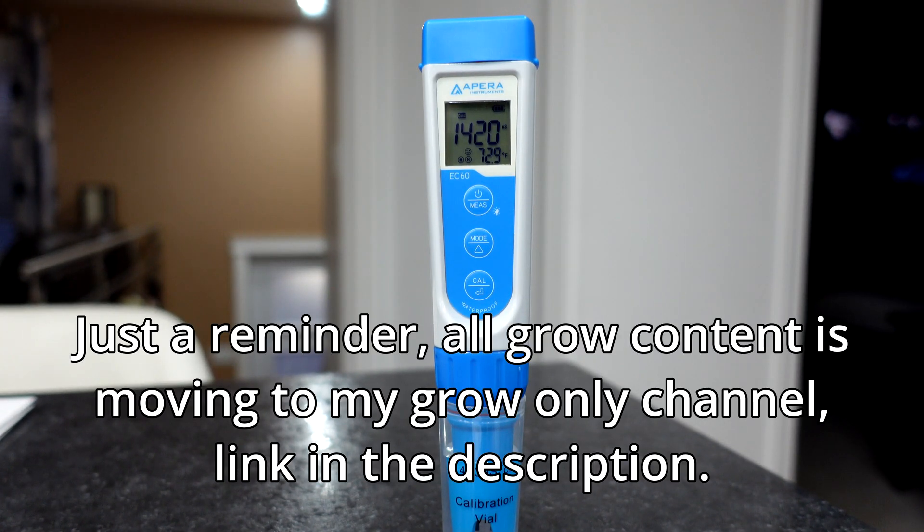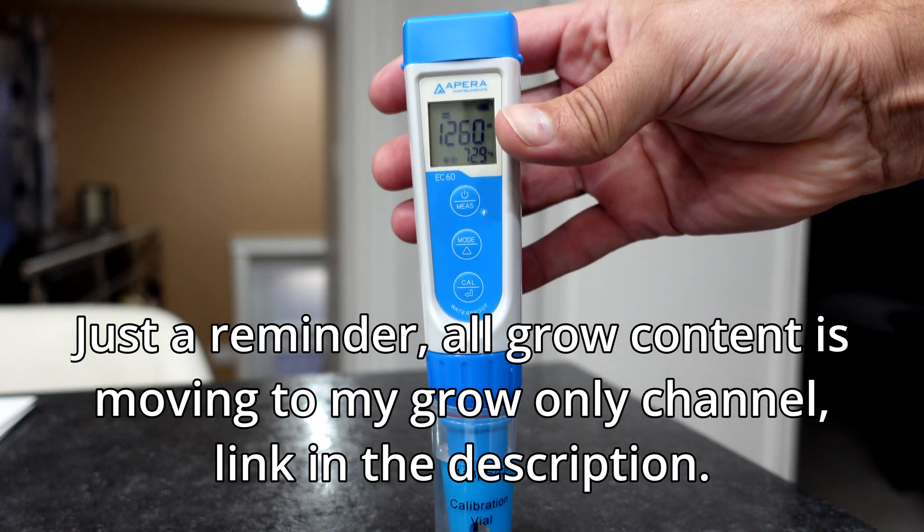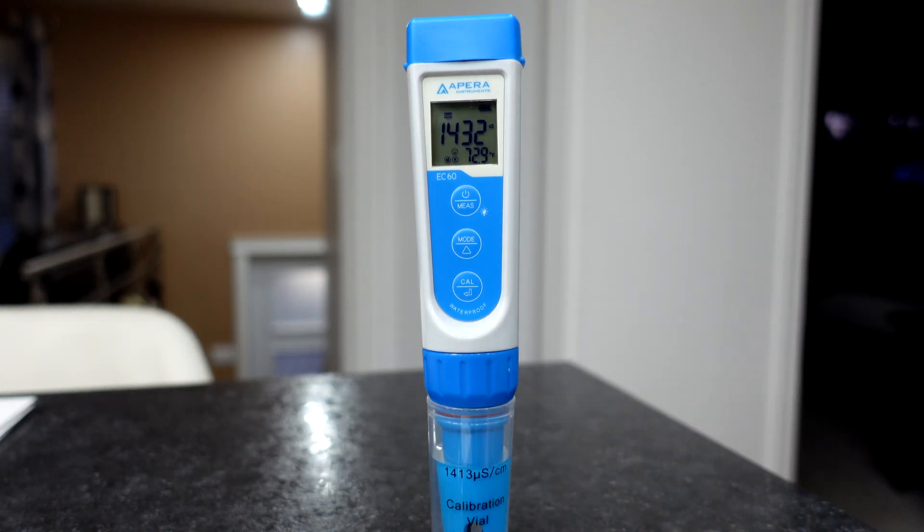1421. Or close to. That's pretty dang close. 1432.